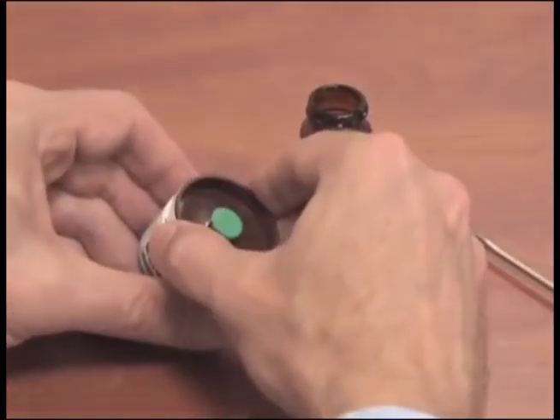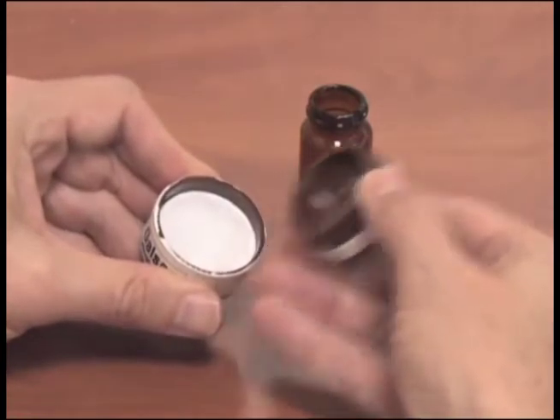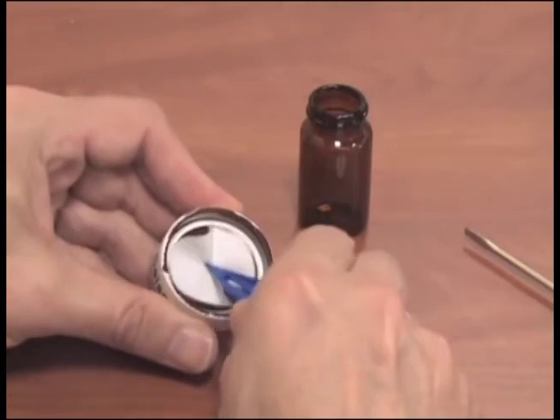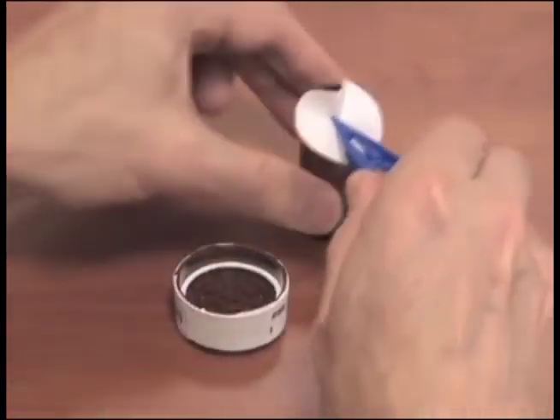To prepare your sample for shipment, cut the gel band along the seam of the top section of the filter cassette. Remove the top portion of the cassette using a cassette opener or screwdriver.